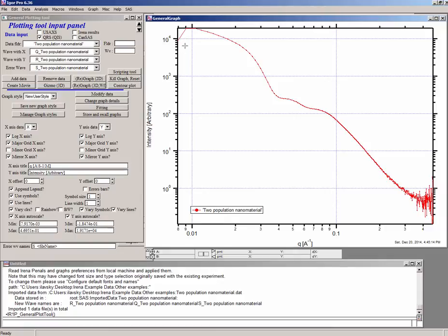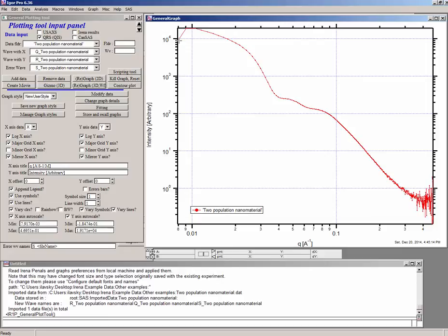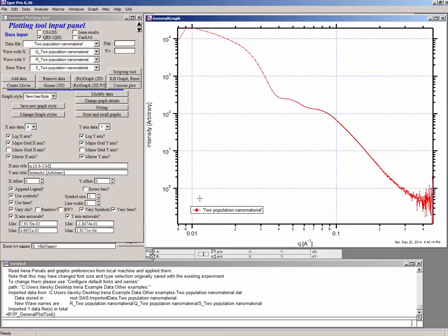Now let's have a look on the data and make first some decisions on if these data should be imported this way or not. The first thing to note is that the first and second data points obviously are wrong. They must be impacted by a beam stop or something because clearly there is no scientific reason in small angles getting why the data would turn down and go down that way. So the first and second points seem to be wrong. And really any data below 0.01 are simply garbage. We should not even have them in there because we don't need them.